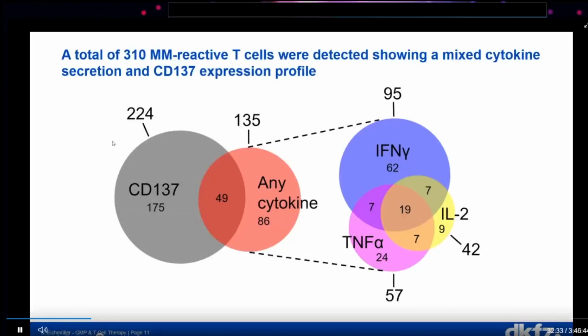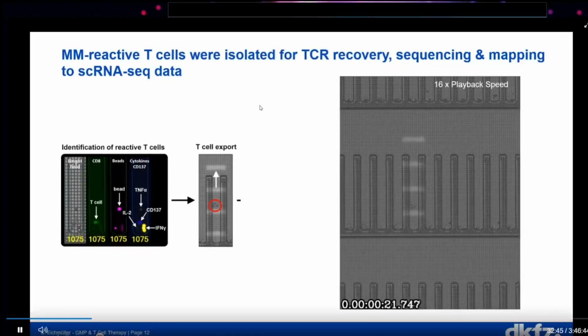And on the other hand, I think that also it is more a function of the cell we are analyzing, and what we are most interested in is now the T cell receptor. So how do we get to the T cell receptor? This was also already reported in the previous talk. There is an option to unpen the cells from one individual pen.